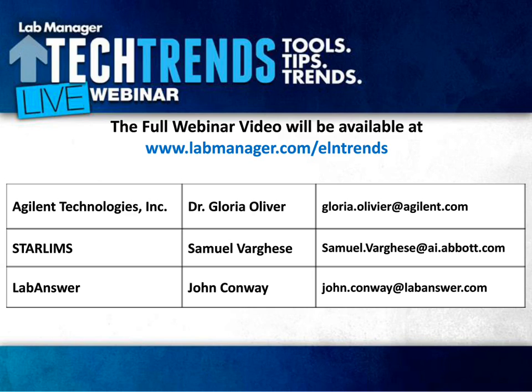John, could you just give a simple explanation of some of the issues surrounding request management? Yeah, I appreciate this question. Request management in the life sciences space has typically consisted of numerous applications for requesting materials, particular assays, and people's time. What has happened over the years is that there are all these ways of requesting, but it was never tracked very well, and the systems have grown old. If you're going to deploy a centralized ELN or other application involving people, data, and processes, you need to make sure that it has or can work with a solid request management system.